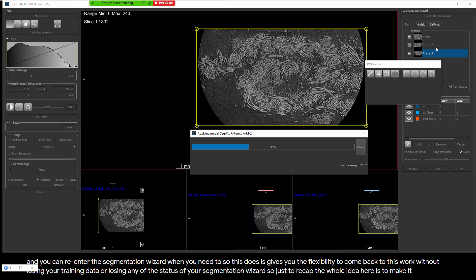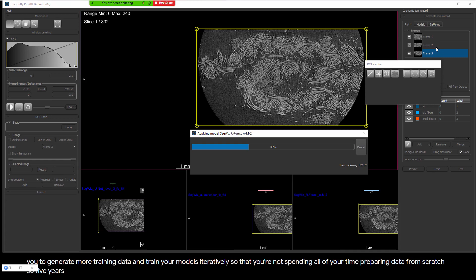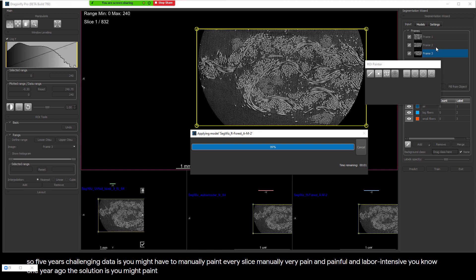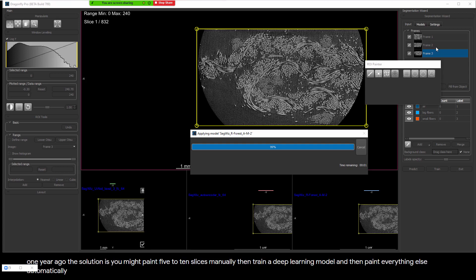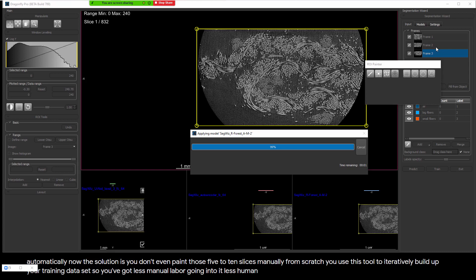Just to recap: the whole idea here is to make it easier for you to generate more training data and train your models iteratively so you're not spending all your time preparing data from scratch. Five years ago, the way you would segment challenging data was to manually paint every slice — very painful and labor-intensive. One year ago, the solution was to paint five to ten slices manually, then train a deep learning model, and then segment everything else automatically. Now, the solution is you don't even paint those five to ten slices from scratch — you use this tool to iteratively build up your training data set, with less manual labor and less human interaction.